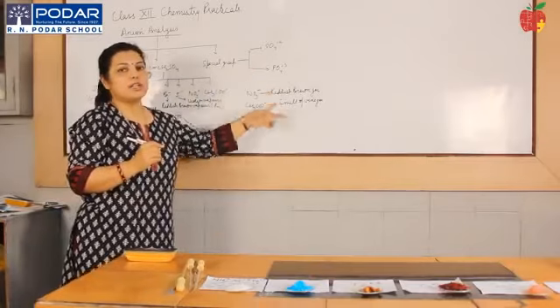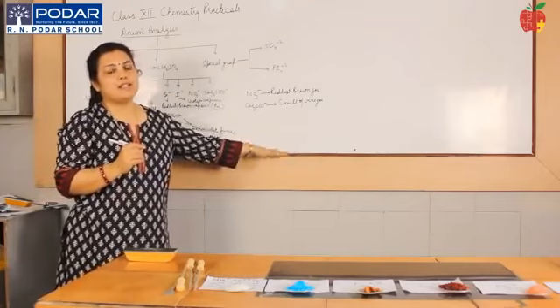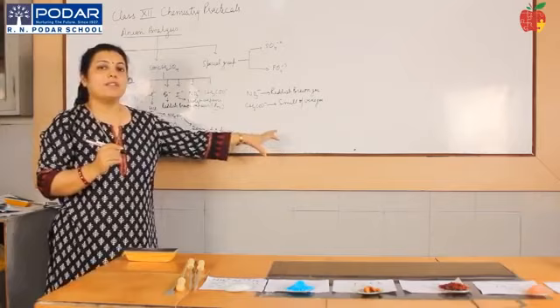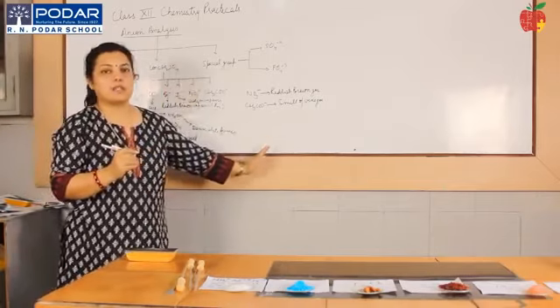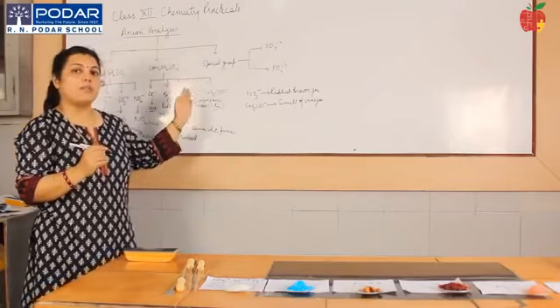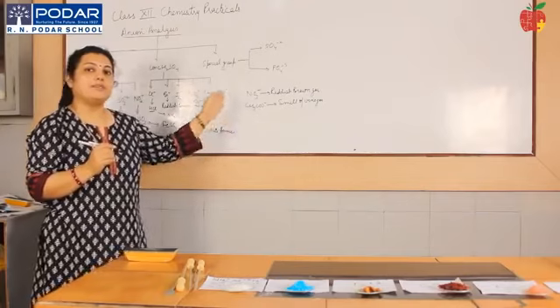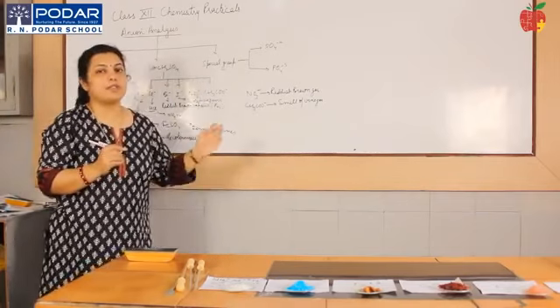We have individual tests. The kind of test that we are performing here, which only indicates the presence of a certain anion of a particular group, is basically known as a preliminary test. So all these are your preliminary tests that we have discussed up till now. Once you are able to analyze the anion in the preliminary stage, then you will have to perform the respective confirmatory test for each one of them to confirm the salt.